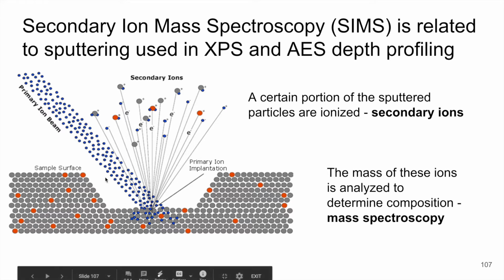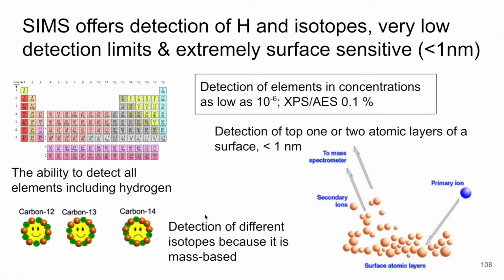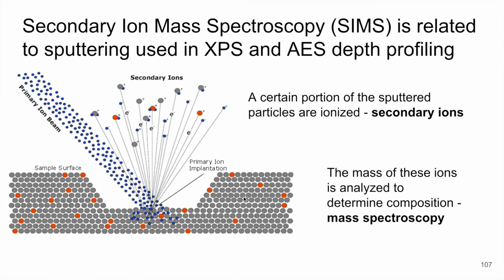Also, the fact that we're able to constantly remove sample means that we can also do depth profiling with this technique very easily. And so that's something that we use here.